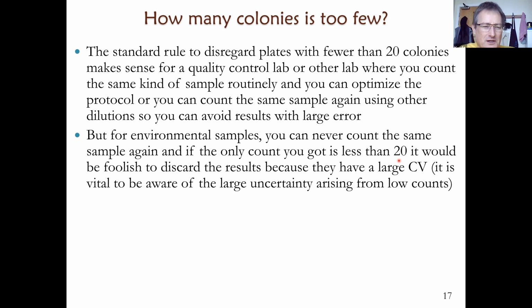Okay, here's another way of doing it that I think is preferable. The example is the same, the numbers are the same, but because the higher the number of counts, the lower the sampling error, we will now include all the counts. So we sum all the counts from all 4 plates, which is a total count of 418. And then we sum all the volumes that have been counted. We need to work out the volume of the undiluted sample that has been plated out.